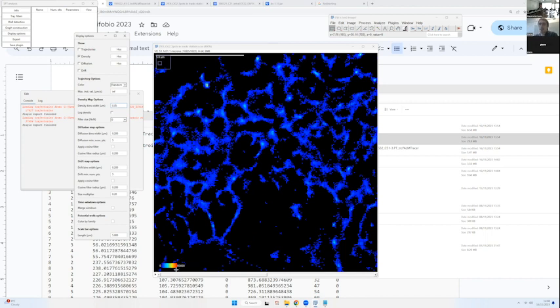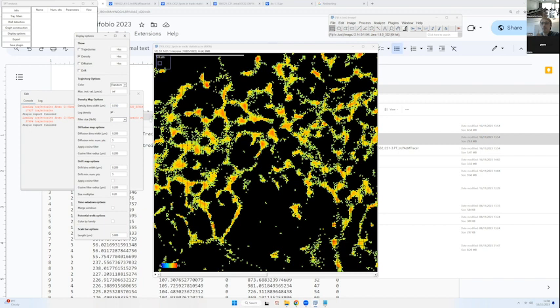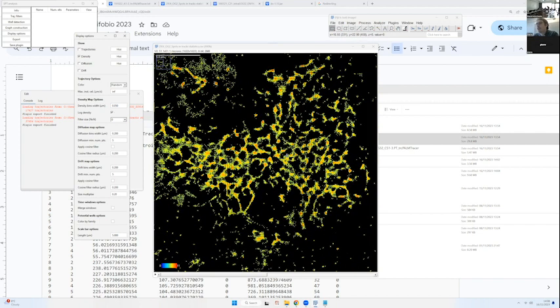And actually, with density map, we have big variations. When you have bins with a lot of points, the density will be very large. So to reduce this variation and see it better, usually we use the log of the density map. So if you check log density in the options, this will just compute the log of the value. And you see that now the map is between 0 and 11. And here we have a better idea of the variations.